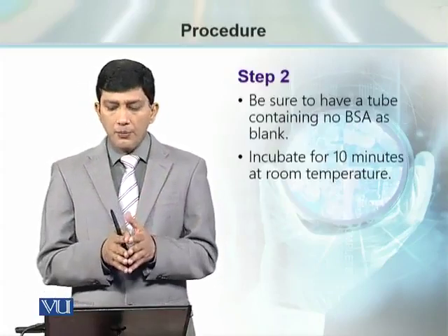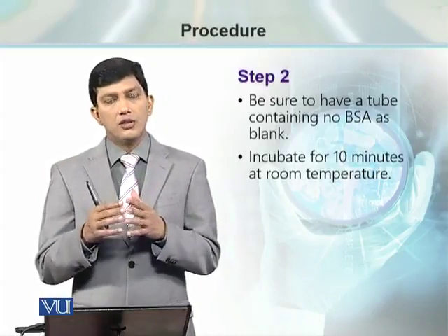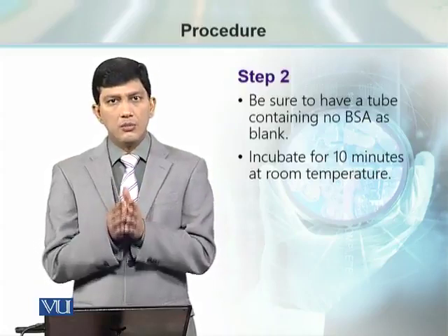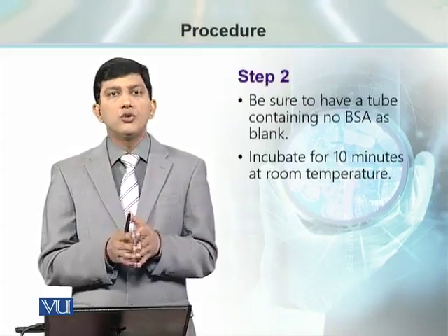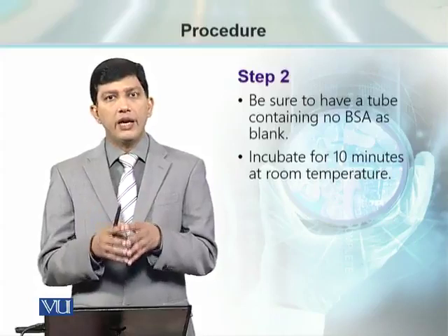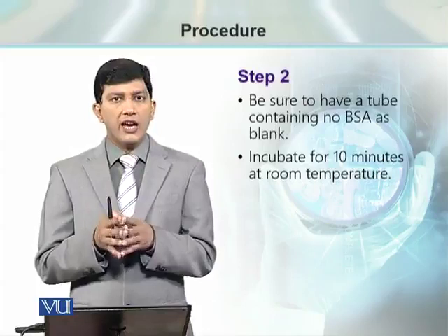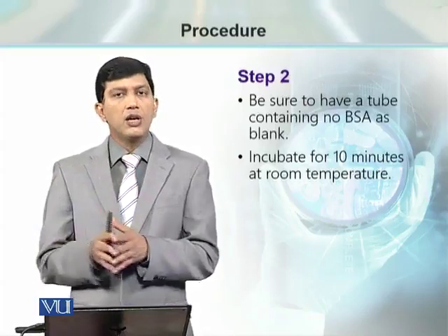इसके अलावा एक हमें ब्लैंक के तौर पे ट्यूब यूज़ करनी होती है ताकि जब हम स्पेक्ट्रोफोटोमेट्री की तरफ जाएं वी शुड यूज़ some liquid as a blank. For that purpose we are going to have a tube which has no BSA, which has no other protein sample added.